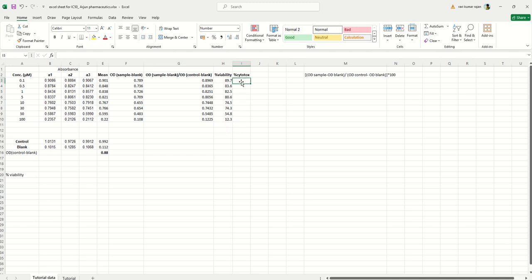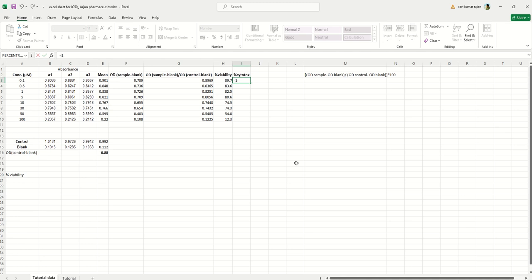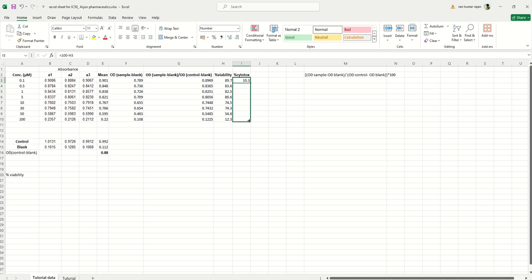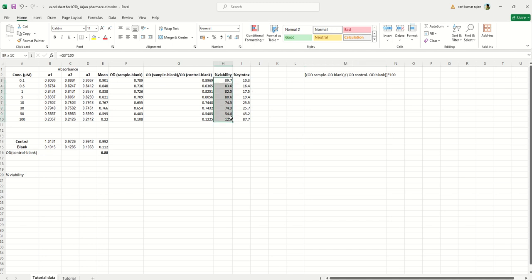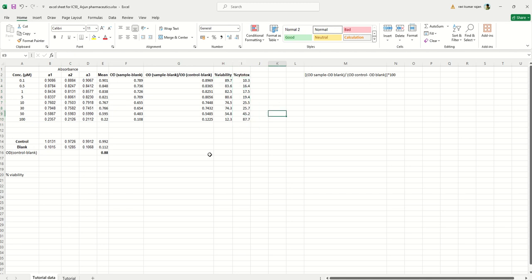To find the percentage cytotoxicity, subtract the percentage cell viability from 100: equals 100 minus percentage cell viability, then drag it down. In this way you can find both percentage cell viability and percentage cytotoxicity. You can create a table or a bar diagram with these values, as commonly seen in published papers.